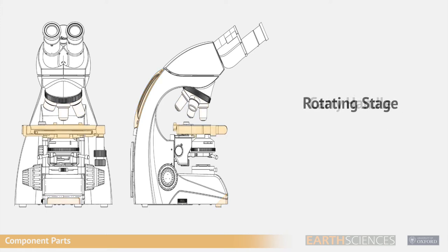Carry handle, rotating stage, quarter wave mica plate, sprung loaded stage clips, sub-stage condenser, aperture diaphragm, condenser height focus knob, and rotatable polariser.